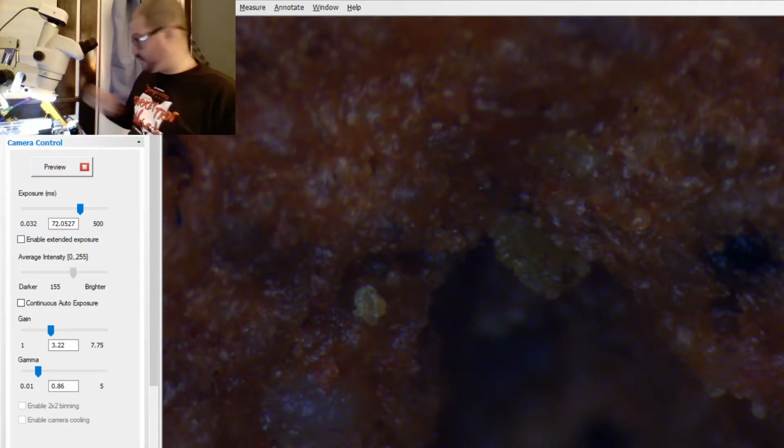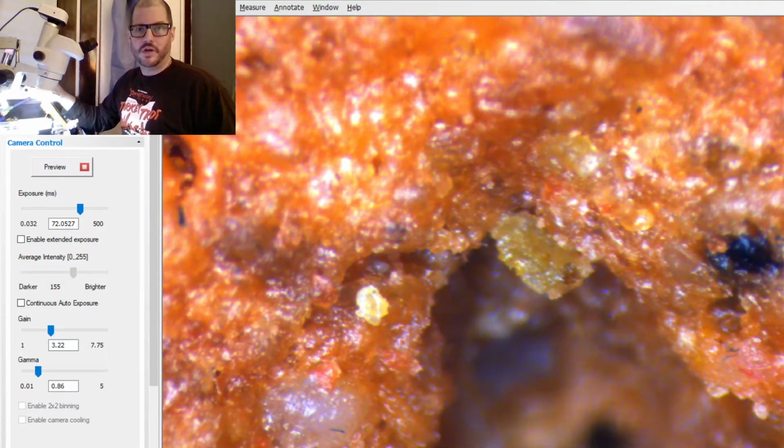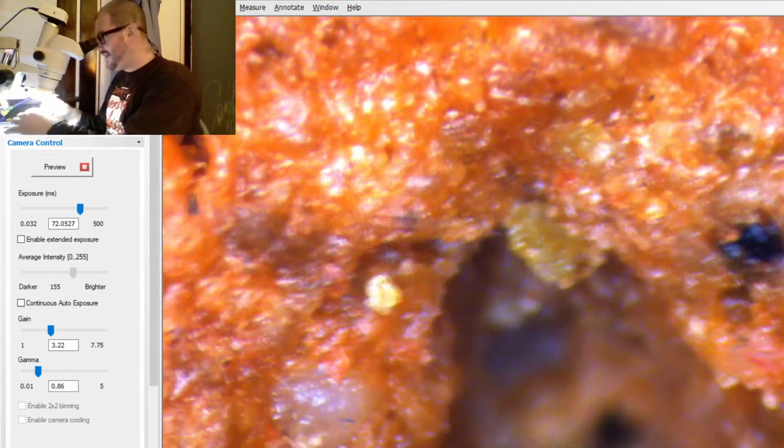Because I don't know what dog food is made of. Let's increase the brightness a little bit on this as well. Just notice that. Whoa! Look at all this stuff. It's incredible. Oh, look how! Look at that! What is that thing?